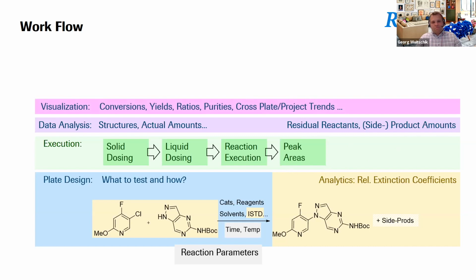But analysis is nice, but you have a customer, he or she needs to know what works and what doesn't. So you need to visualize it, and you need to visualize it not only in the context of the plate that you're working in right now, but also ideally as a lab, you want to be able to learn across projects.